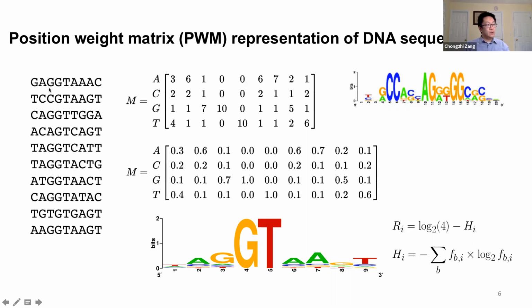Say, for example, if we do a ChIP-seq experiment and identify a bunch of binding sites, and then, for very simplified information, if we know that our transcription factor can be interacting with these several DNA fragments, the sequences. The position weight matrix is to represent or to measure the shared or the common information located in these different sequences.